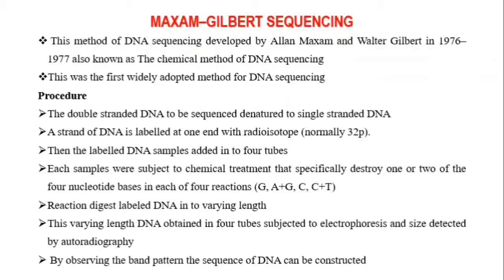This reaction digests the labeled DNA into different fragments of varying length.